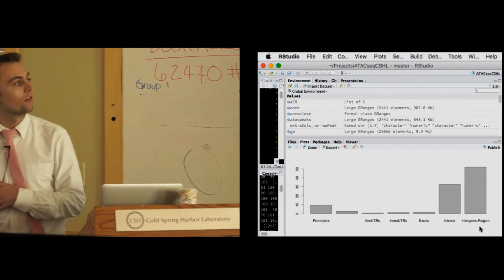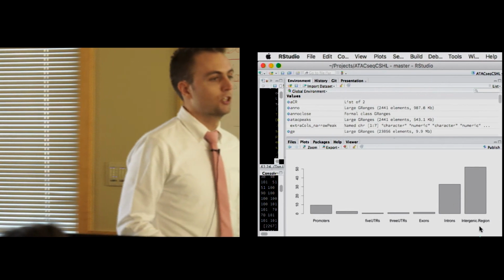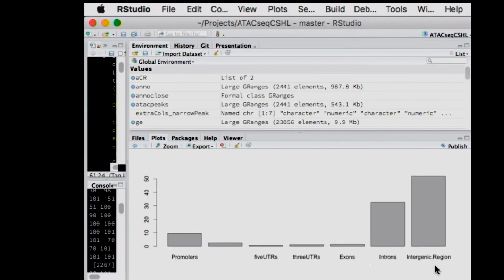This far plot is intron. Intergenic covers areas further away than 2.5 kb between genes, so you could call those putative enhancers, I suppose. You want a little more evidence that there's a regulatory event happening there to call it an enhancer. But likely. Not many exons, like we'd expect.